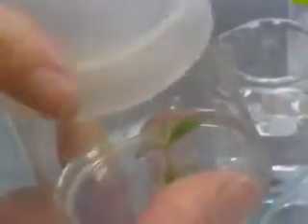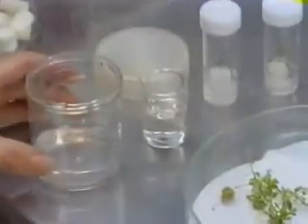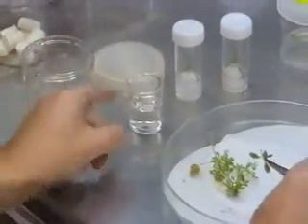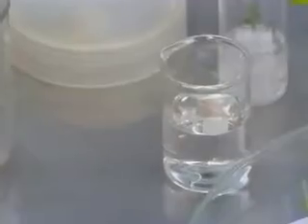With other plants, rooting is best if the propagule is kept in the auxin medium for only 1 or 2 days and then transferred to an auxin-free medium, or the propagule may simply be dipped into a rooting solution immediately and inserted directly into an auxin-free medium.